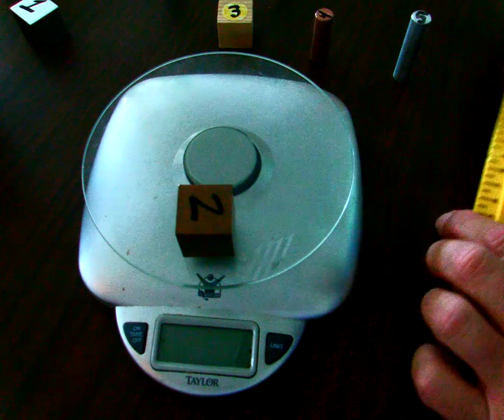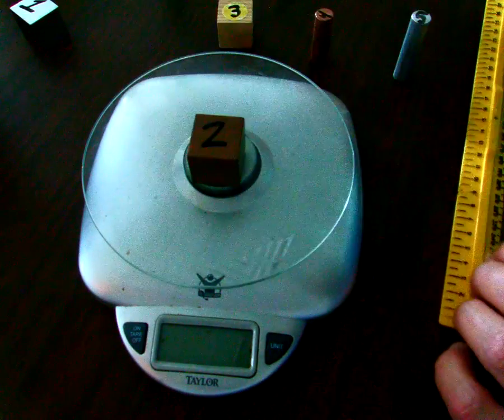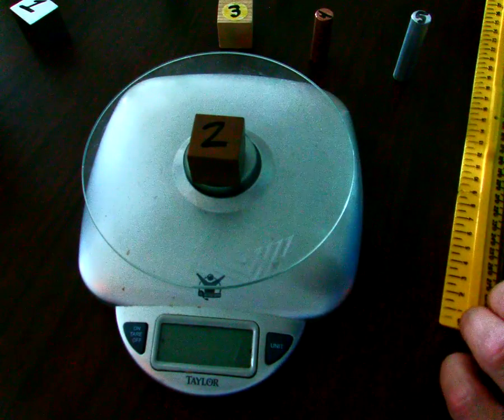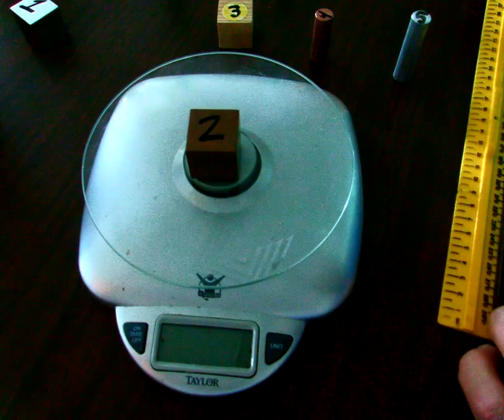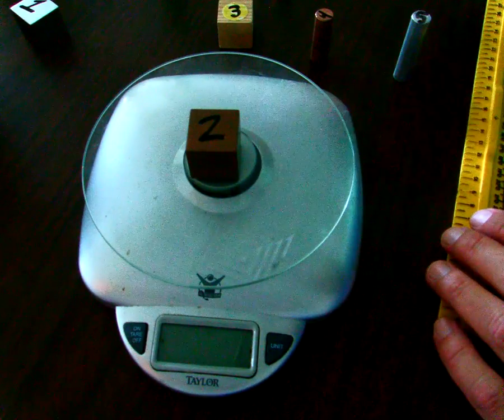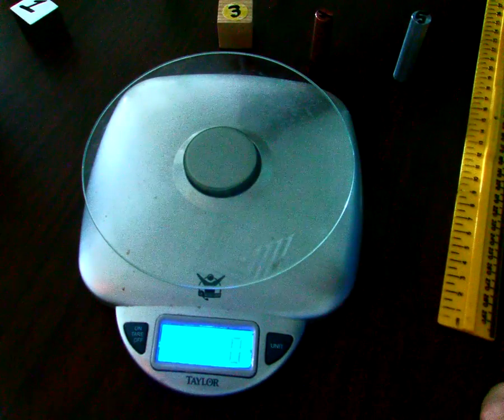Okay, so go ahead and take a second to calculate your volume of block 2. You should come out with the same answer that you did on block 1. Both of those blocks take up the same amount of space. That's the definition of volume. Volume is the amount of space that an object takes up. So we're going to go ahead and turn on our scale so we can mass block number 2.